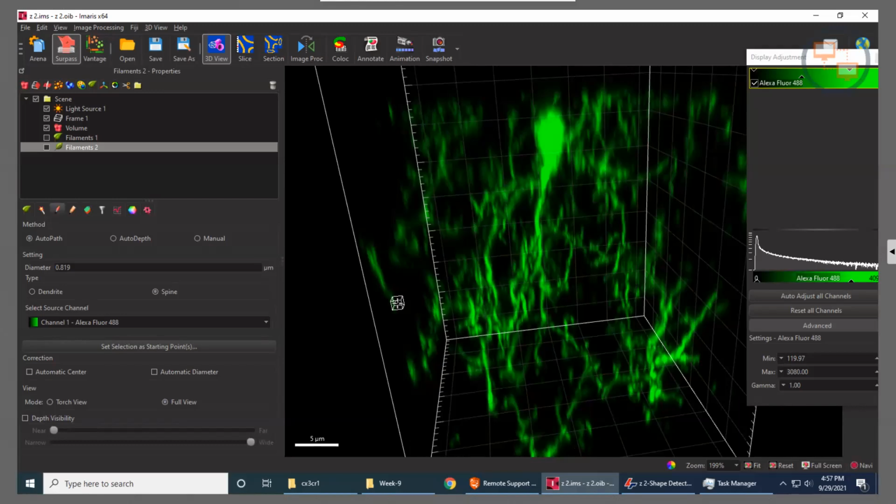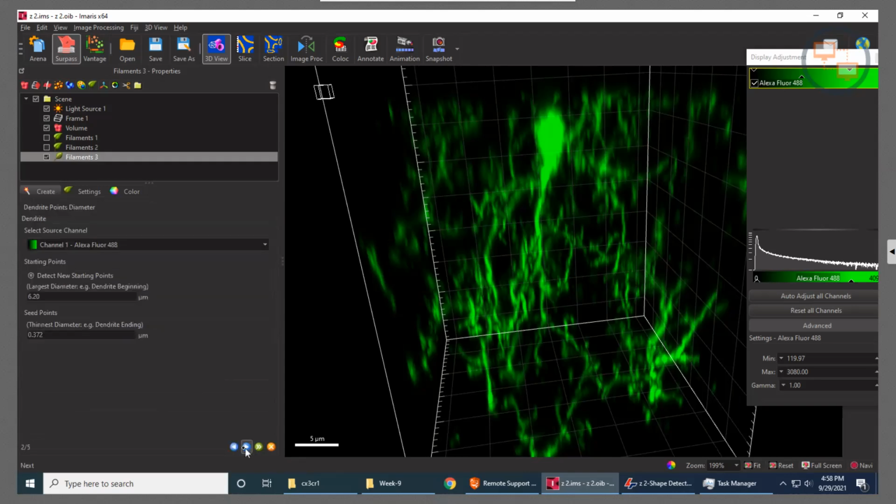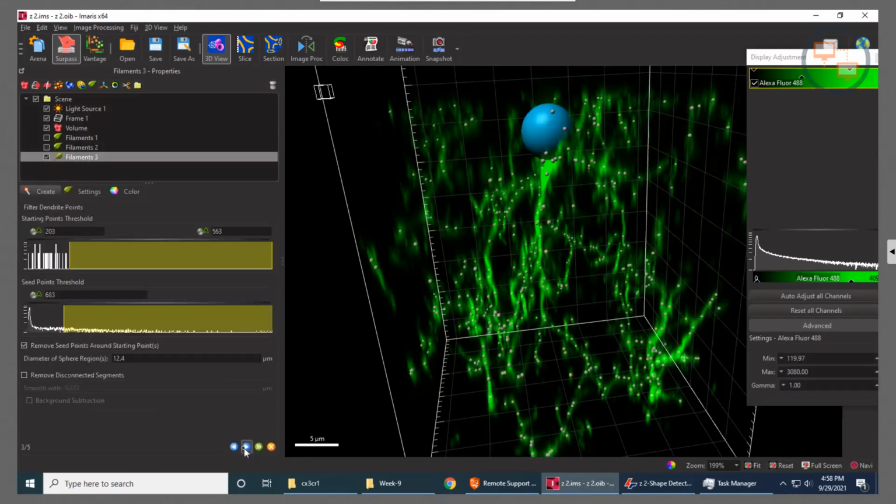These are very good questions. We'd have to take a look at your data to see exactly where the issue arises. Without doing that, when we specify the number of seed points, if you specify too many before running the algorithm, that could take a while.